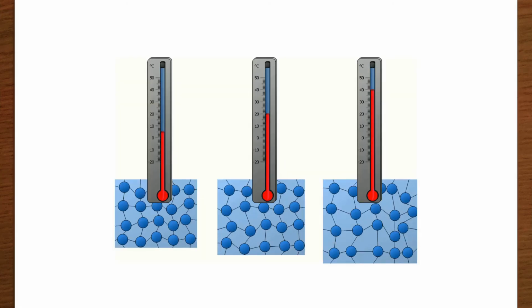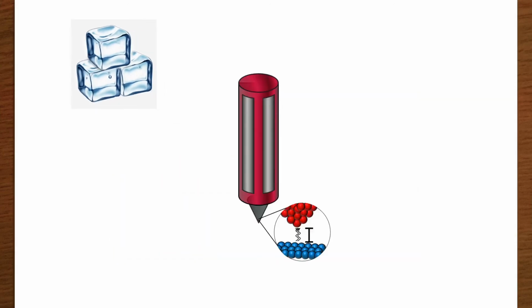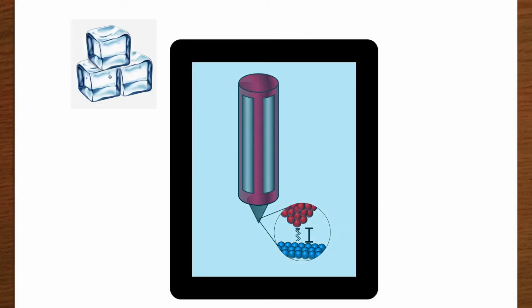Now there are some caveats that we have to address. What I said before is by no means simple, so it's definitely not the complete picture. First, as you might know, temperature is the result of particles vibrating. So if you're doing measurements at the atomic scale, you have to make sure things are really cold. Secondly, since we need samples to not be affected chemically by airflow, the sample and the tip have to be in a vacuum chamber.